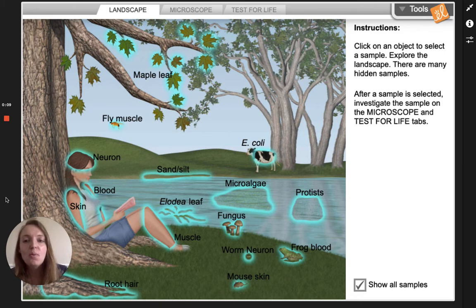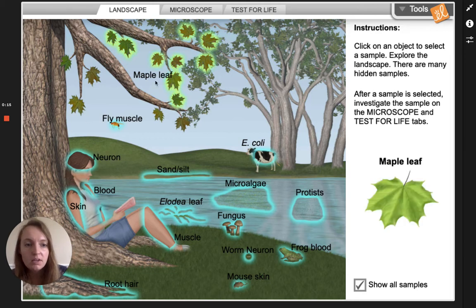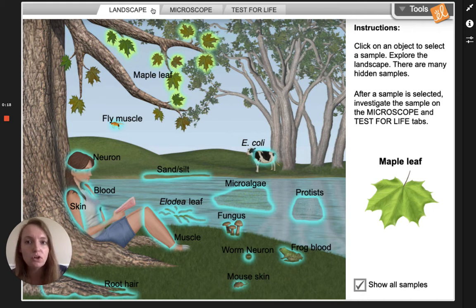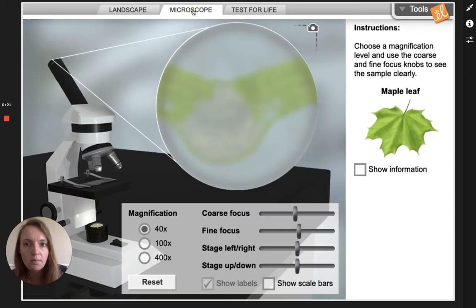First we are gonna look at a sample of a maple leaf. I'm gonna go ahead and click on maple leaf. There's my sample and I'm going to put it under the microscope. At the top there are some tabs, so I'm gonna click on microscope.